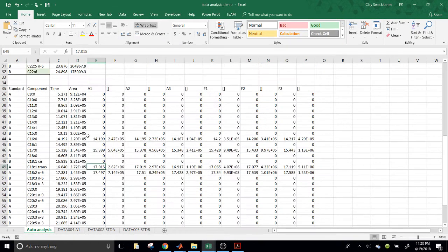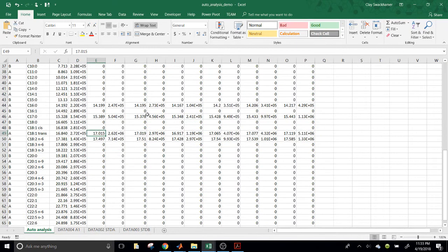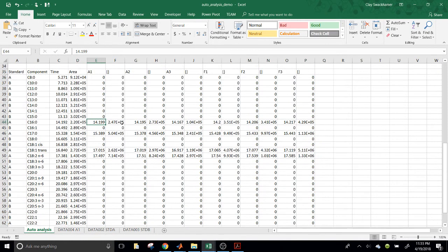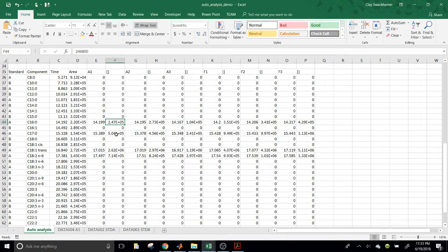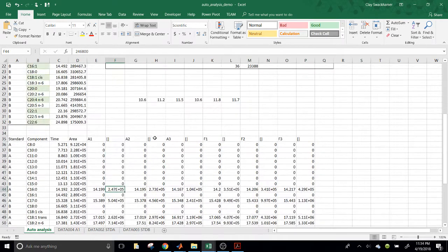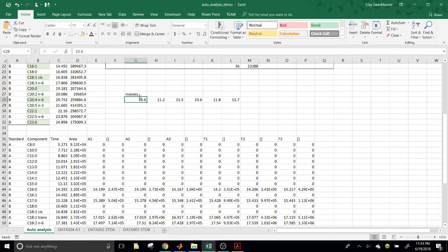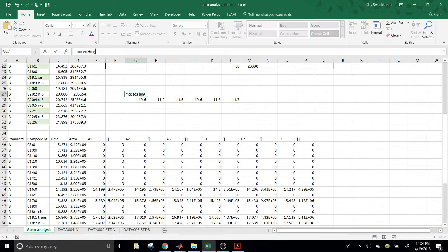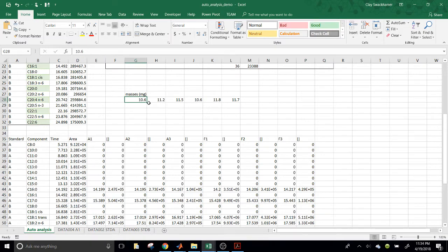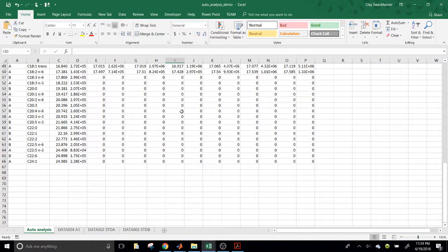Now, the next thing that we might want to do in this workflow is figure out what's the concentration. So, we've sorted this thing, and now we might ask ourselves, all right, so we have this retention time in this area of this compound. Now, what is the concentration of each fatty acid in each sample per original sample mass? So, let's say we have these sample masses right here. These should be in milligrams. So, there are 10.6, 11.25, so on and so forth milligrams.